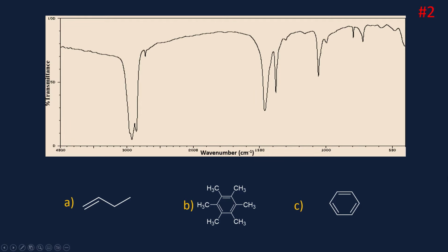Let's look for this one. We have 3 molecules that have a carbon-carbon double bond, and have a try with it on your own for a second. The answer is simply choice B, where there is no sp2 carbon-hydrogen stretch in the hydrogen region.